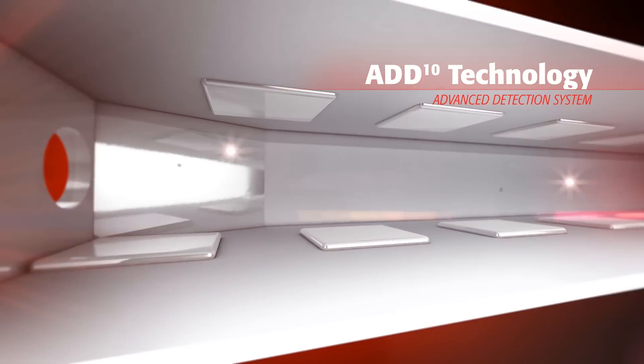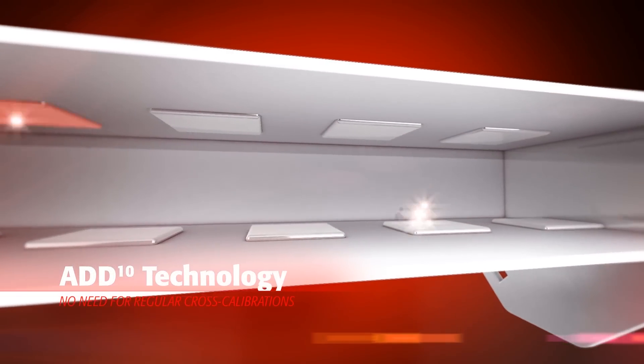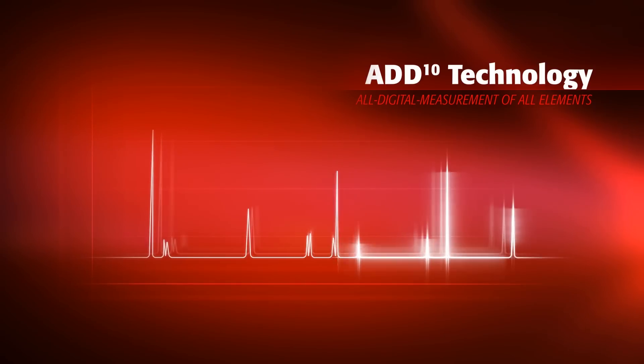The only ICP-MS to offer all digital detection technology, the PlasmaQuant-MS allows for fast and accurate multi-element analysis from ultra-trace to major levels in a single measurement.